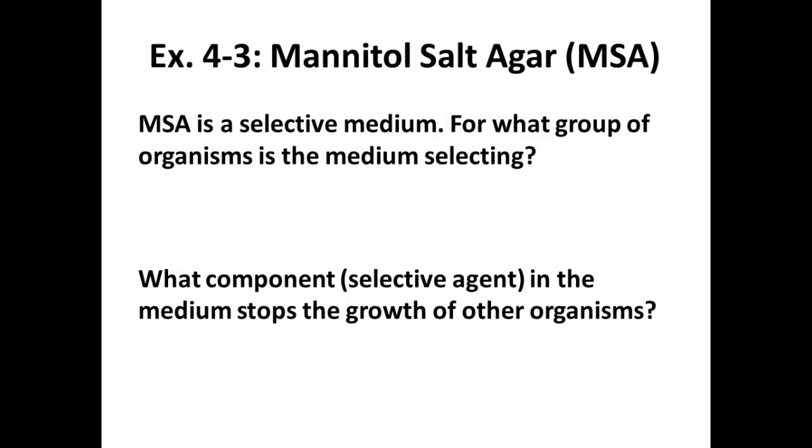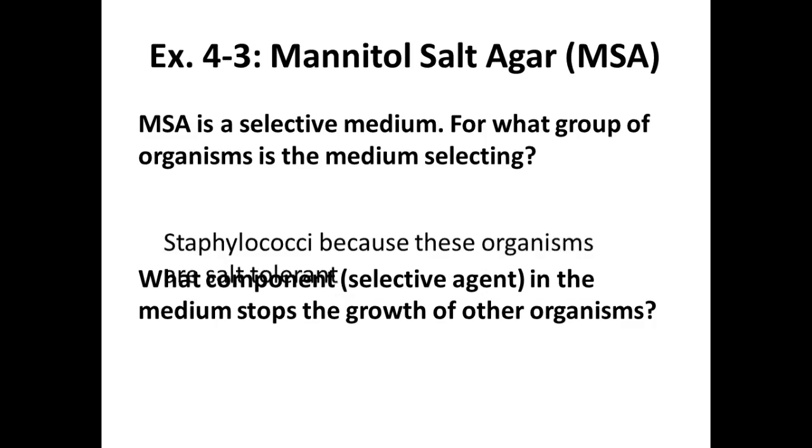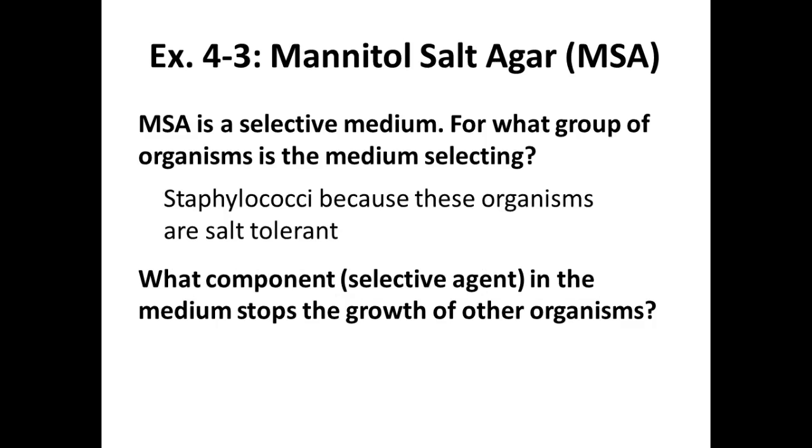So the first one we're going to talk about is Mannitol Salt Agar, abbreviated MSA. And this is selective for what group of organisms? Anyone know? Mostly Staphylococci in clinical specimens. And this is because they are salt tolerant. The selective agent in this media is salt.